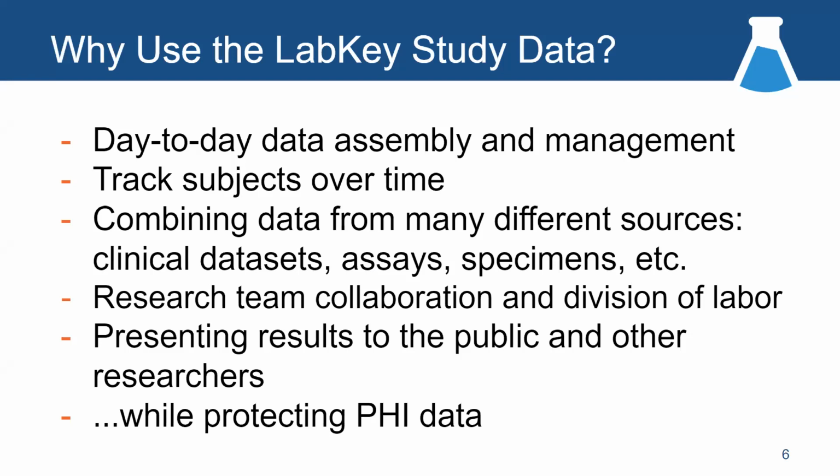There are other cohort studies. LabKey is really useful in all these cases. It's really optimized for that whole broad range of work that you could be doing. And so we lump them all together and use those terms as synonyms for this presentation.